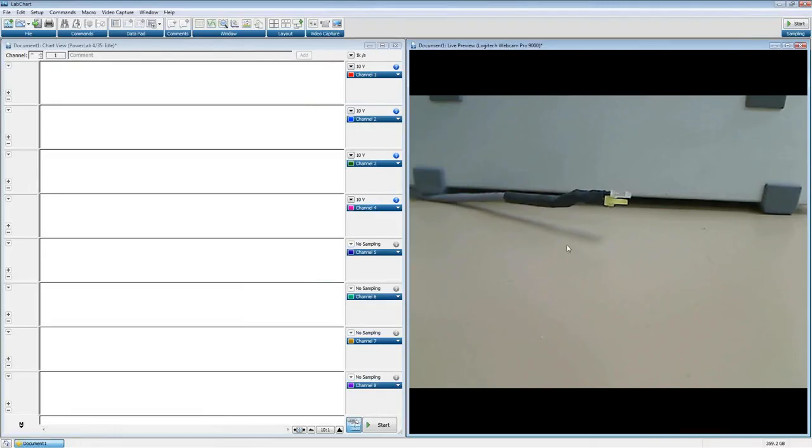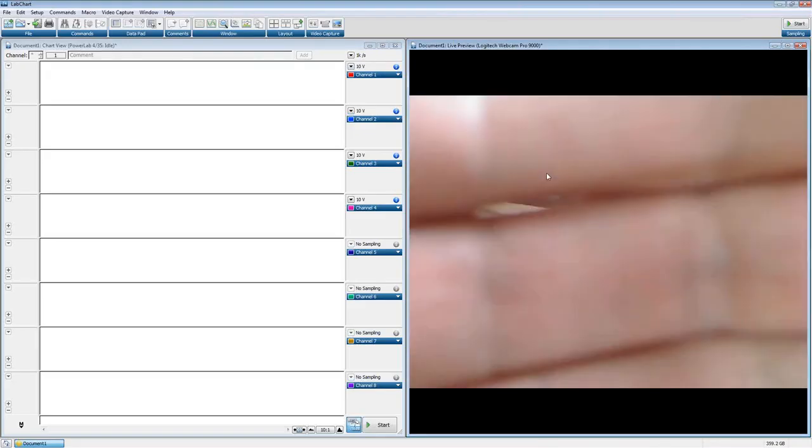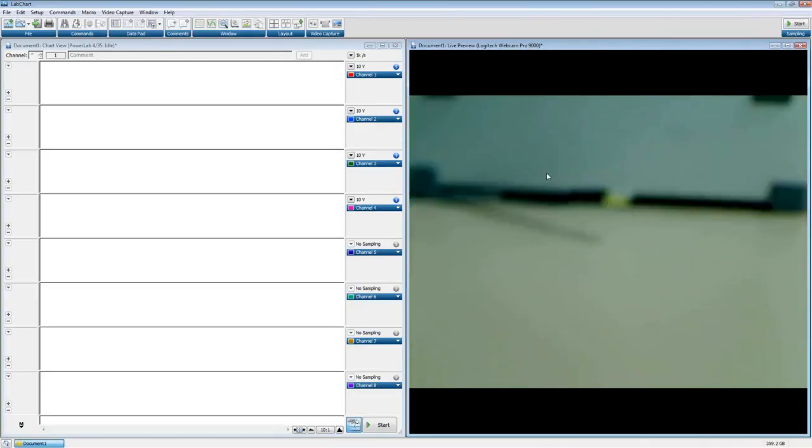So, as I said, we'll start talking about digital inputs and outputs. I'm also going to direct you to, I'm inputting a live video into LabChart with our video capture module. We do have webinars later on that explain more about it, but it's a way to pipe video into LabChart and record it with a file. But for today's uses, I'm just going directly to a camera that's recording live here.